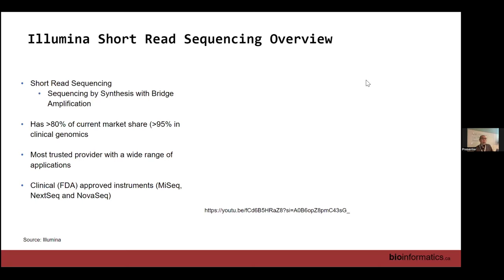Perfect. So a couple of things I should take away is that, again, number one is that you're sequencing your DNA fragments and each of them are present in a very, very small quantity. And so the first thing first, as you see, is you need to first clonally amplify the same fragments. And that's actually through the bridge amplification.